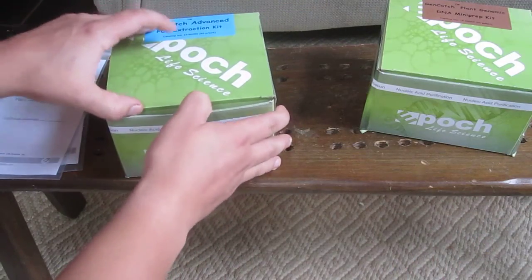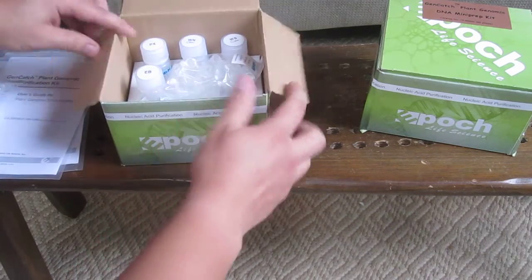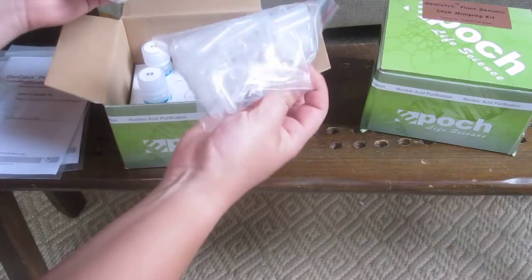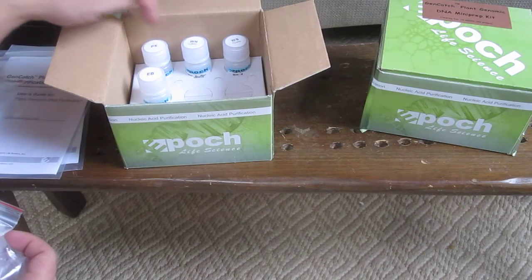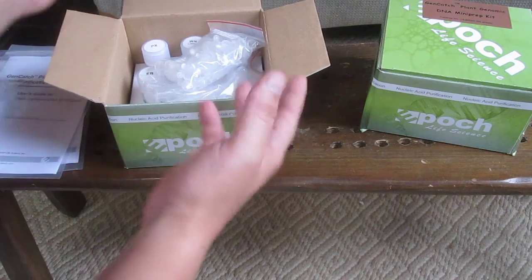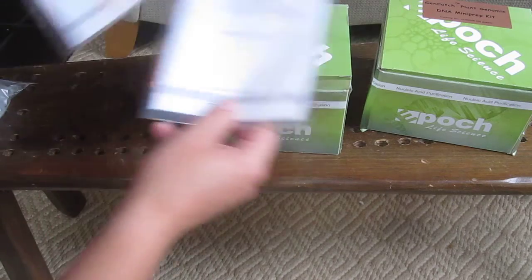And then in the PCR extraction kit, which can be used to clean up your PCR products after reaction, you have some silica spin columns, collection tubes, elution buffer, and a few other buffers. All can be stored at room temperature, so you don't need a fridge for any of that. These will store up to two years. Each comes with its own manual.